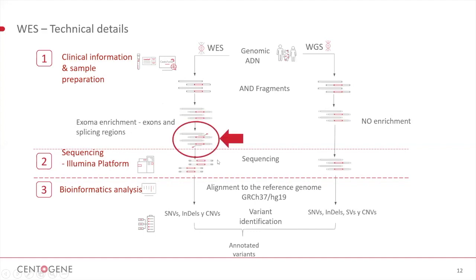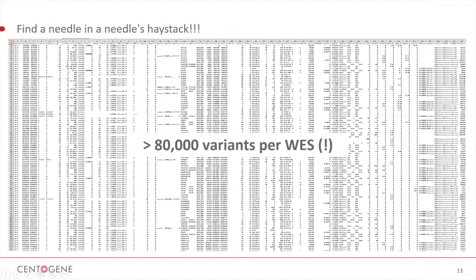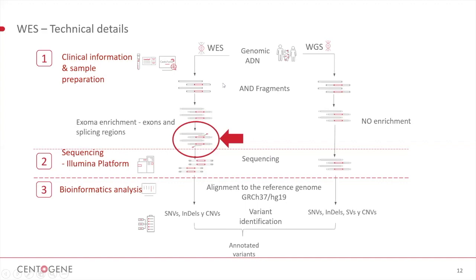What is different in the process of the whole genome from the whole exome? In the whole genome sequencing, we are not doing extraction of the exons or the exon-intron boundaries. We are not doing the amplifications. It's uniform coverage of the whole genome, including the coding and the non-coding region. And so there is no enrichment and there is no amplification bias.